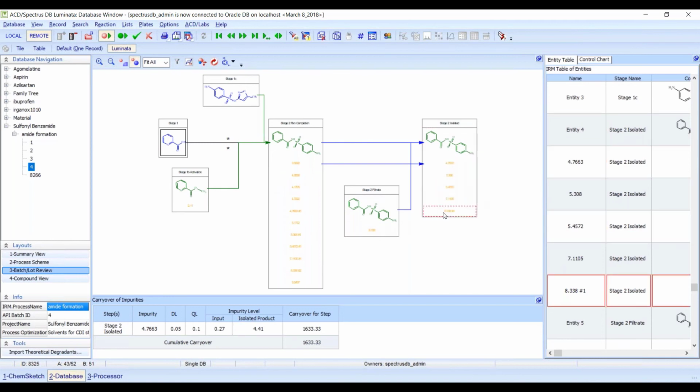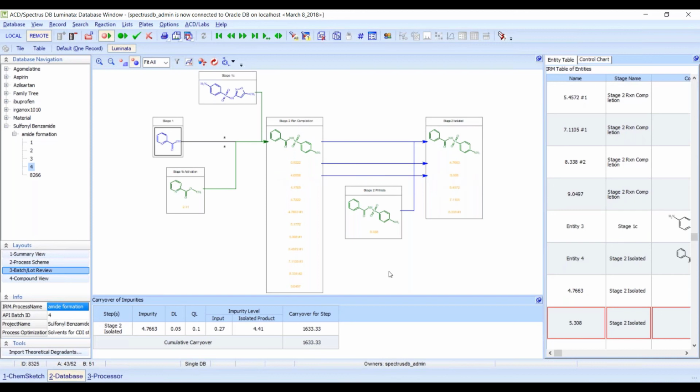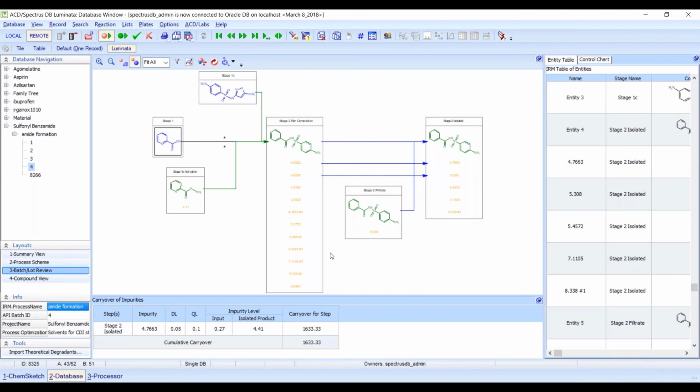Now from there, just like you saw, you can map your impurities. So if I wanted to, I can take from the reaction completion and draw that. And this is quite crucial when we're talking about it this afternoon and even Thursday as well. From there, from having all these arrows from what you saw with my GMP synthesis and my in-process sampling, I can start deciphering my carryover studies, my cumulative carryovers, and my process optimization steps. So really going through and deciphering what needs to be done.